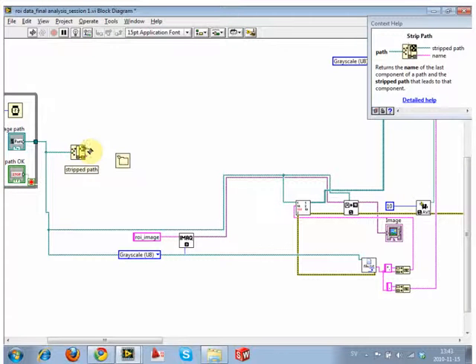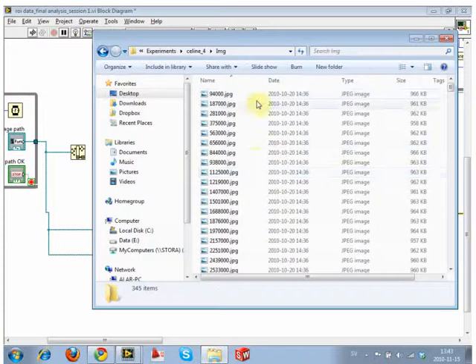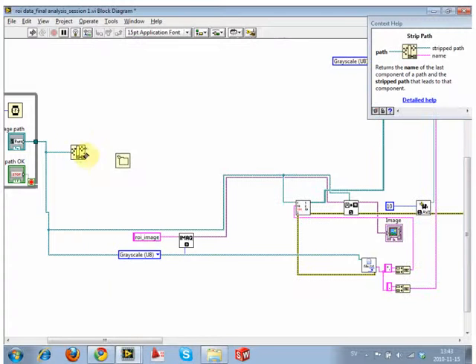So if we made a new folder now, it's going to put it within there. So an example would be, you'd get a new folder at the top of this list. Okay, we don't want to do that. We don't want to put anything in this folder if we don't have to. Might as well put it in its parent directory. So this is the same directory, but we need to go one up. Okay, so then we need to do the same thing again.